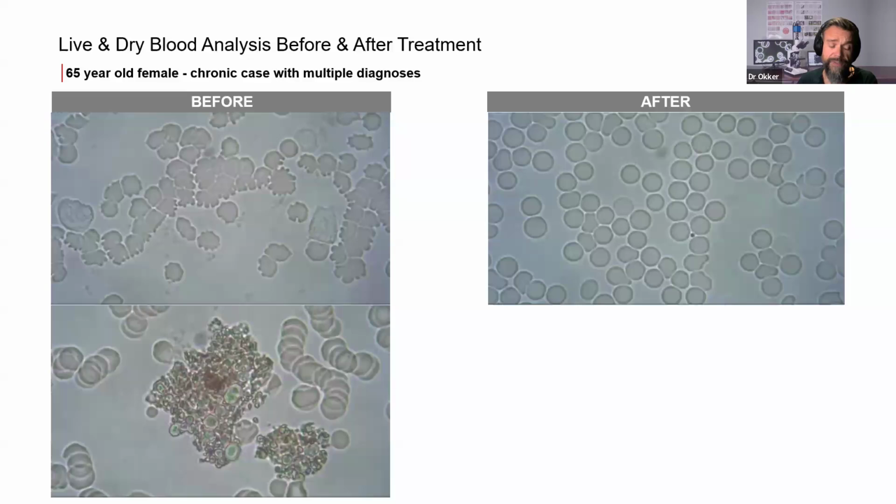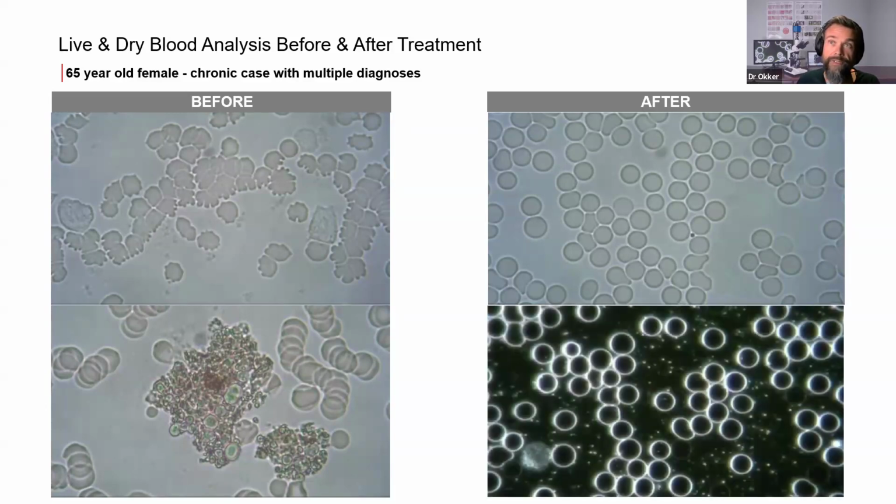We're not able to say which specific organ. Often it is an underlying inflammation that's connected to how chronic diseases develop according to functional medicine as well. The image just below that is a uric acid crystal, and if there's an issue with the pH, that usually drives inflammation in the system. All right, so we can see everything looking a lot better there on the right-hand side.